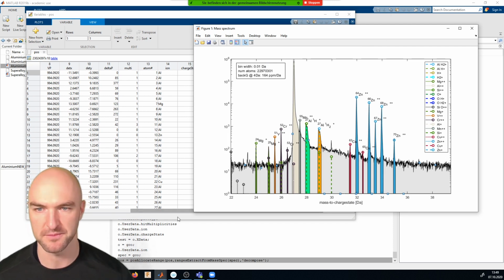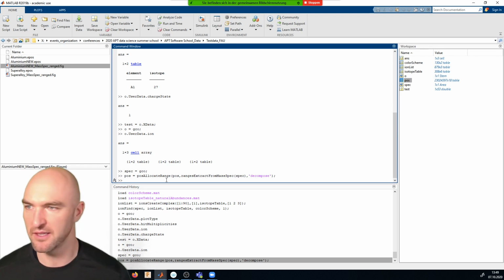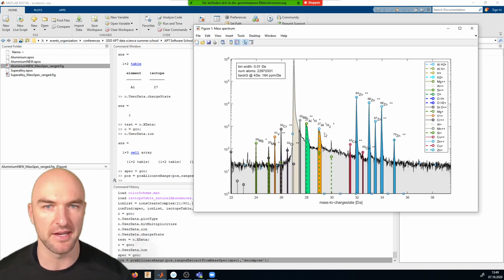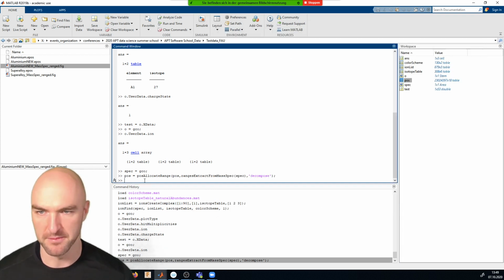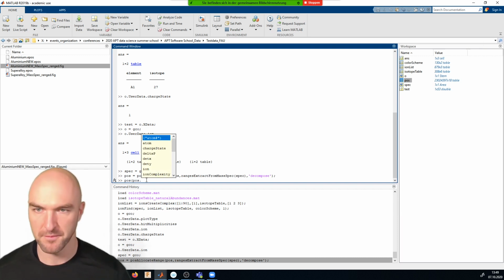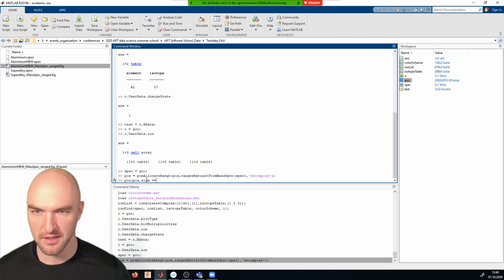And now, obviously, if I wanted to just see the, I don't know, aluminium doesn't make much sense. So maybe I just want to look at the chromium atoms in there. Then I can go and say pos dot atom equals chromium.